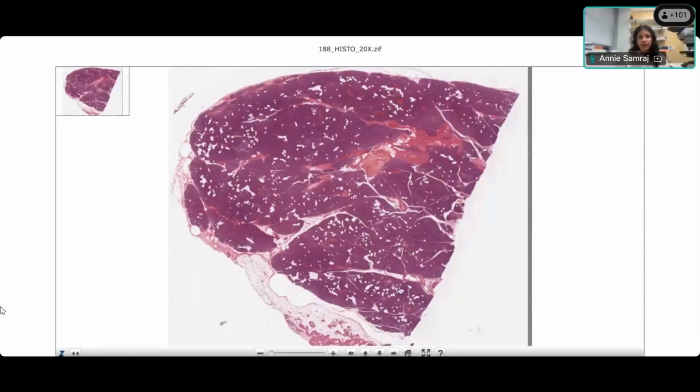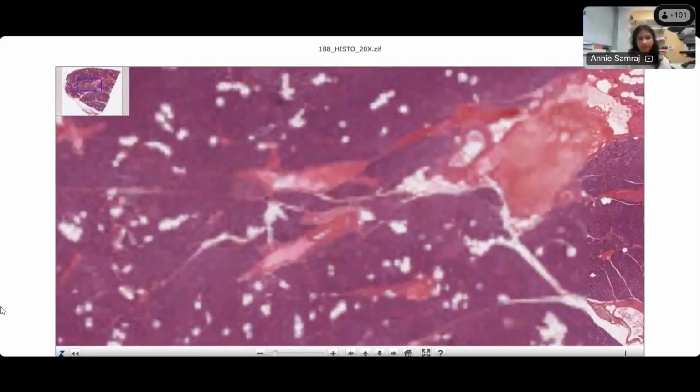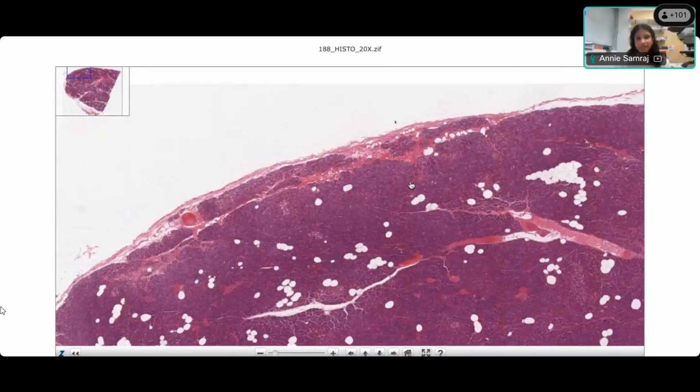Okay, so here we have a slice of the pancreas. This is from a resection specimen. So first question to our residents: can we identify a capsule here? Yes, no, maybe? Yes, ma'am. Okay, trick question. The pancreas does not have a capsule.